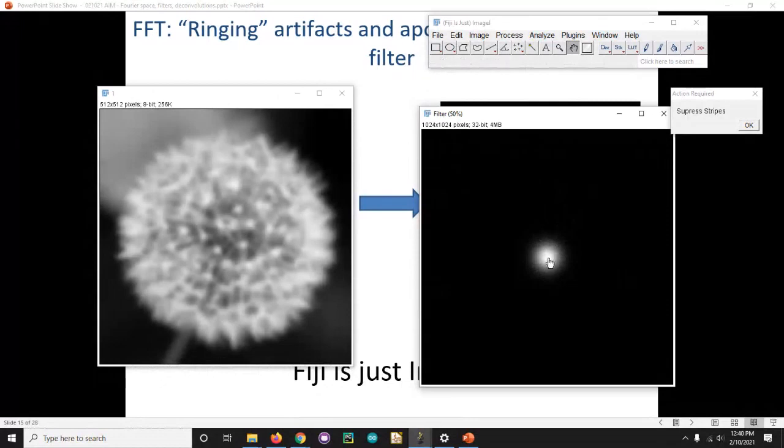So these frequencies were kept the most, and then we suppressed more and more until all these frequencies were almost completely suppressed. And so the end result is now we're blurring our image, but you can see no ringing artifacts. So that's a huge advantage of apodized filters. And the key thing to know is just that filter is right here, the bandpass does it for you.